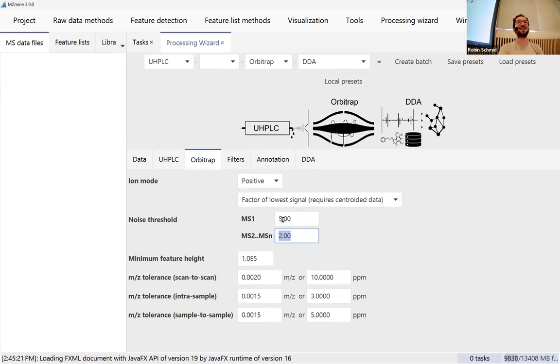You can tell after they are imported. During import you can tell. Yeah, I can show you. Good question. Sometimes I ask myself, how can I know how many files I have?